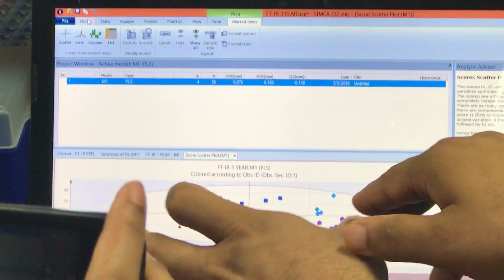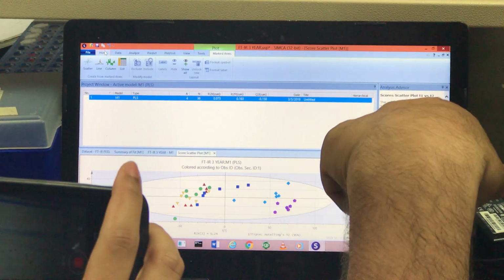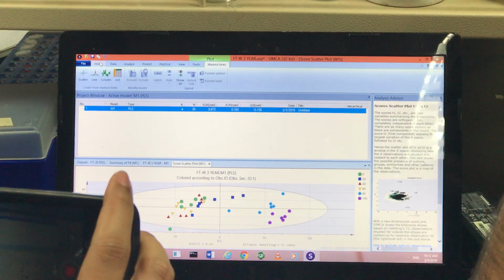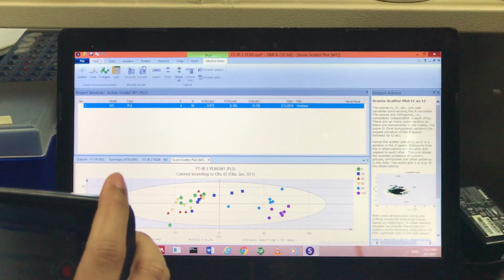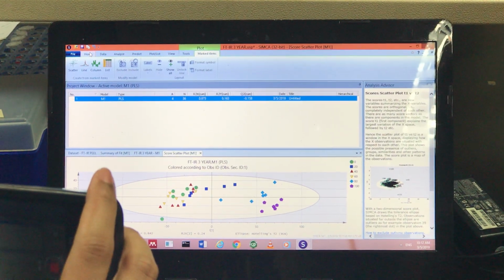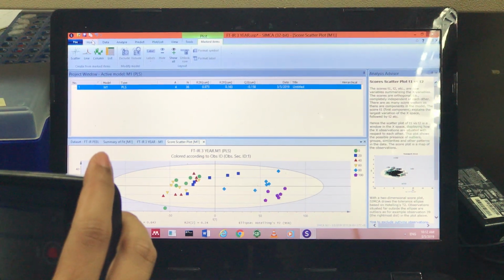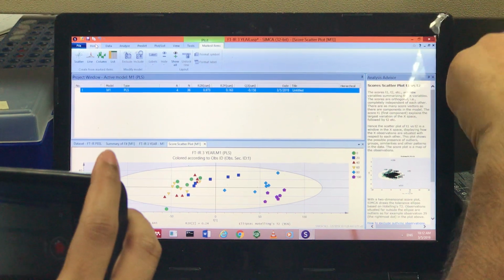This one, this is the score plot. We know the data before. I mean, the software will not tell me if this is active or not active. The software will not speak, but I ran the biological activity. I know the activity. I have to know if I see the 100% extract on one side and 80%, because this is the high activity. You know these things before. The software only helps us after we run it.